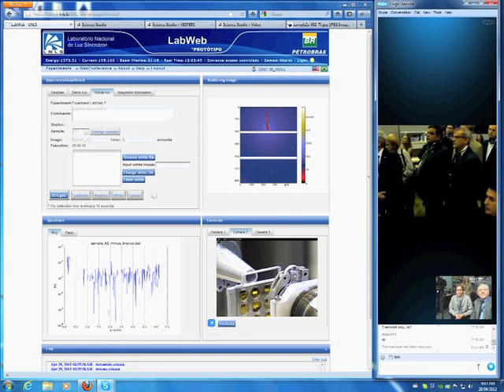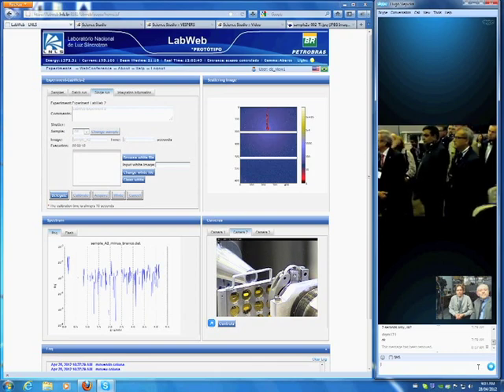This is a filled spot with a sample. It's a spot with a powder. It's a system that is used for drug delivery, biosensors, and many other things. It was synthesized here between Canada, Argentina, and Brazil. Definitely there is a collaboration also in these systems. And what we do is, once we look at these cones, we can recover the structure of it.